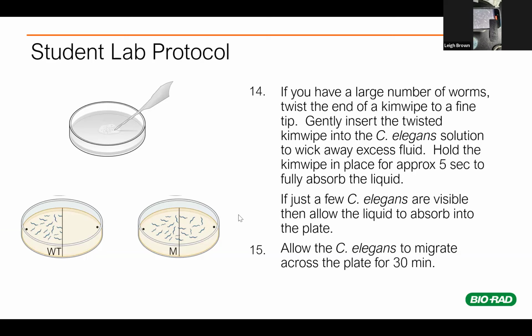Okay, so this is my mutant plate right now. I think you can see how they're just going to town. And this is again flipped upside down. So you just kind of have to adjust the focal plane of your camera or your microscope. I've got a macro lens. Oh, hold on. I've got to show you this way. There's a macro lens on this. We have some links. I think that I sent you in the prep videos, but really, they're not very expensive on Amazon, and they work really well.